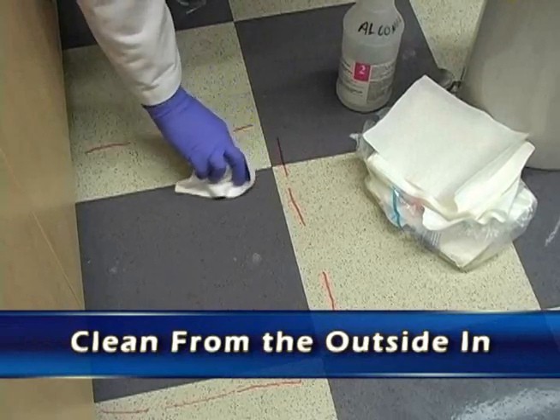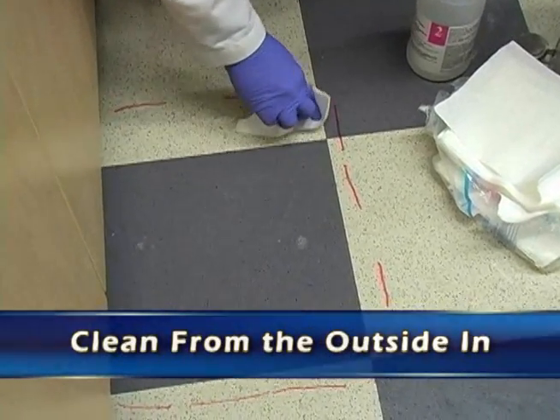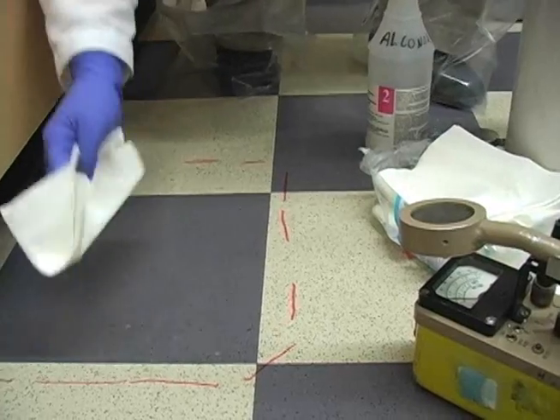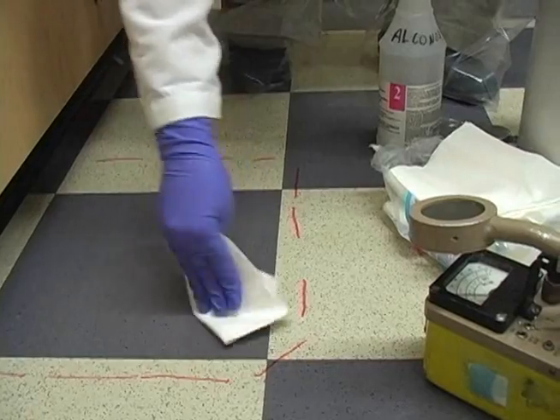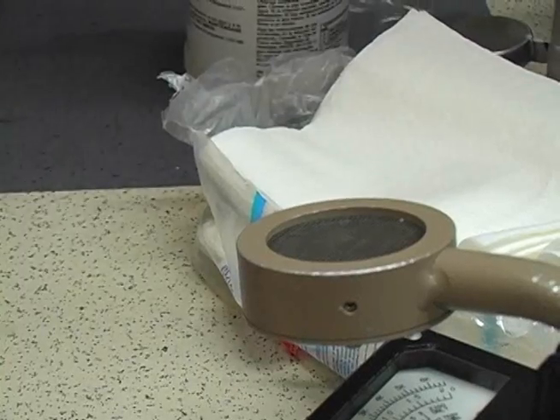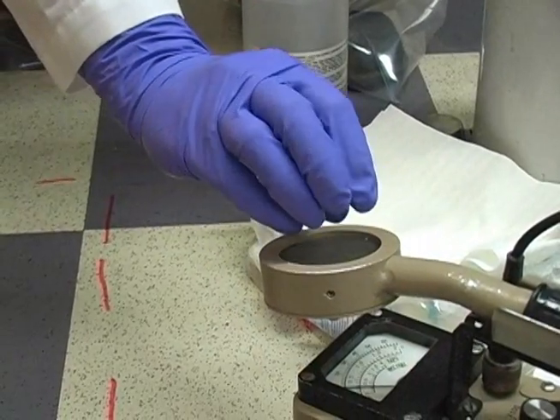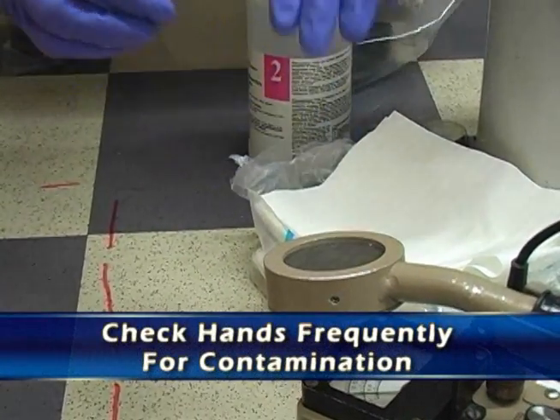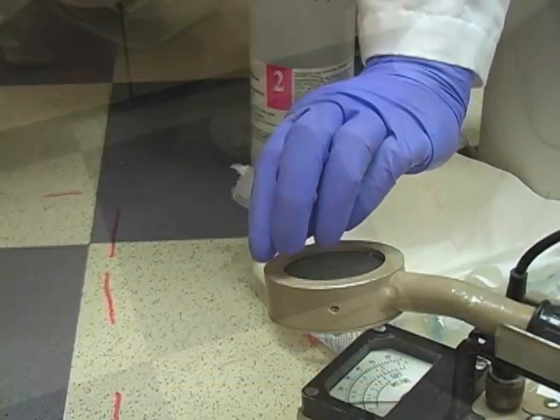Take a paper towel and clean from the outside in — only a small area at a time. Then check to see if we're getting contamination up, and keep cleaning until no more contamination comes up on the paper towel. We can check that with the meter. Frequently check your hands so we don't spread contamination inadvertently.